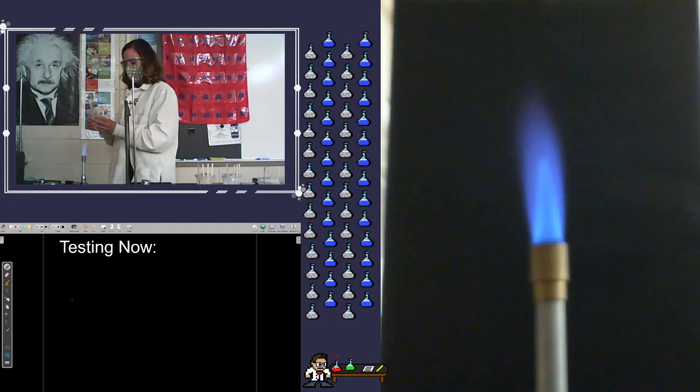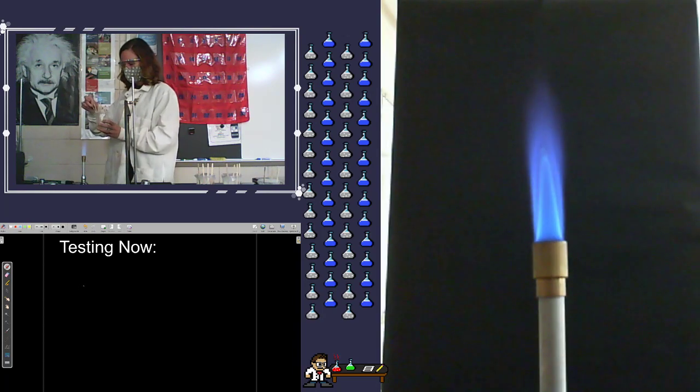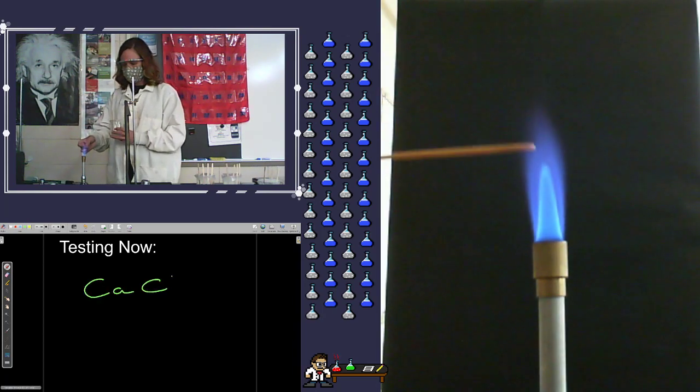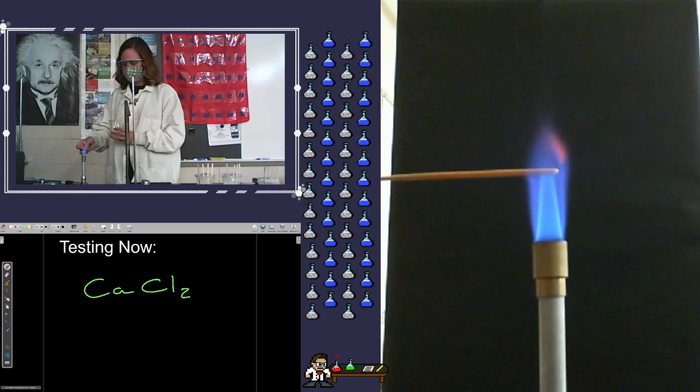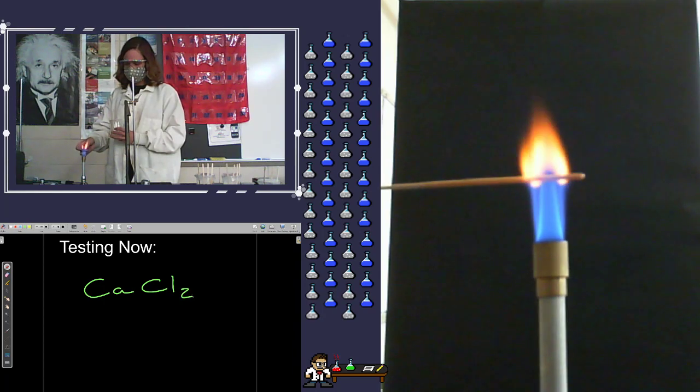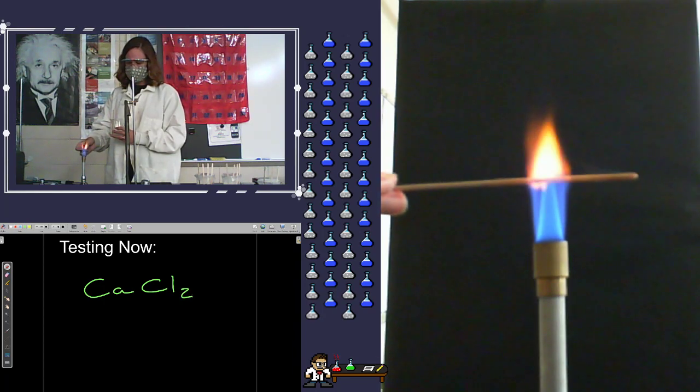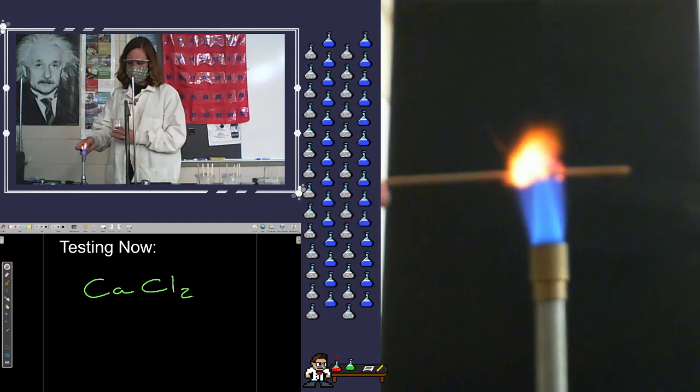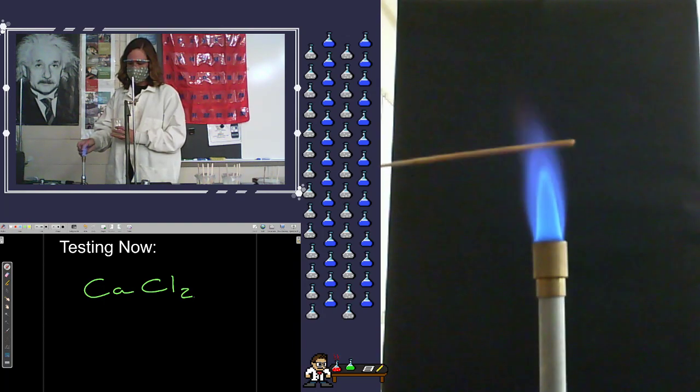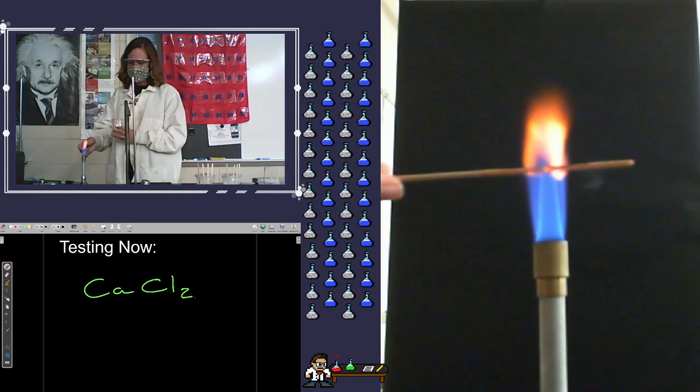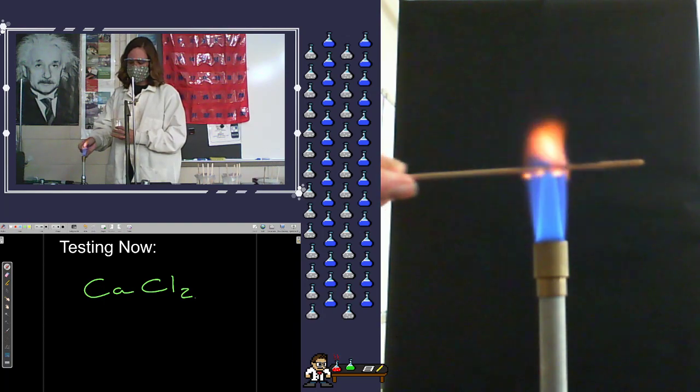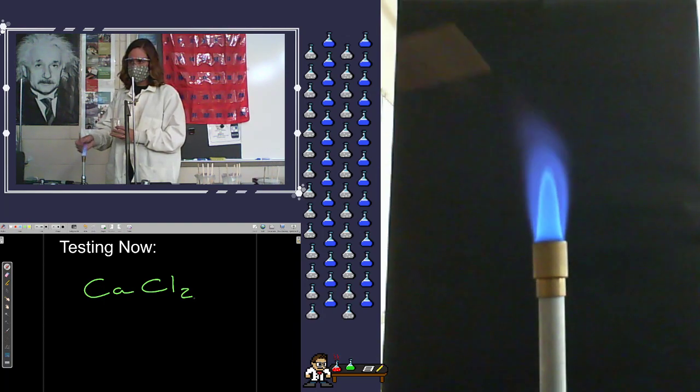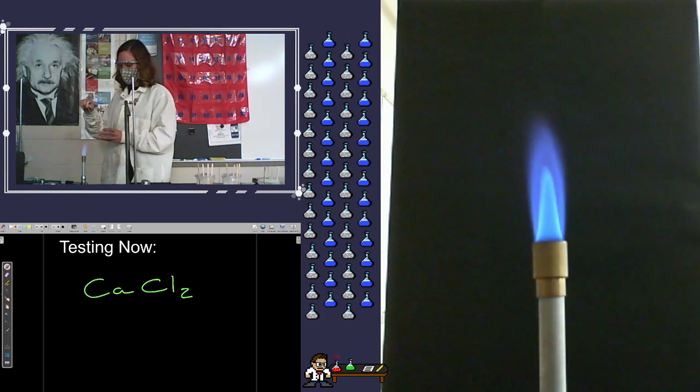Our next one that we have is calcium chloride. It's kind of similar to what we saw with the sodium, but there are distinct differences to it. Think about which one might be more yellow and which one might be more of an orange or a reddish orange.